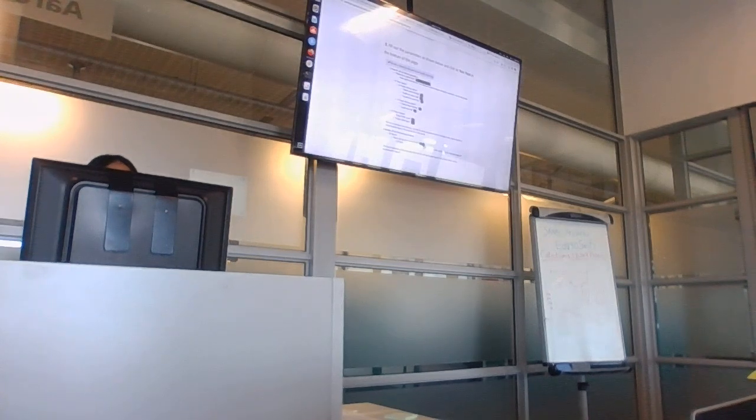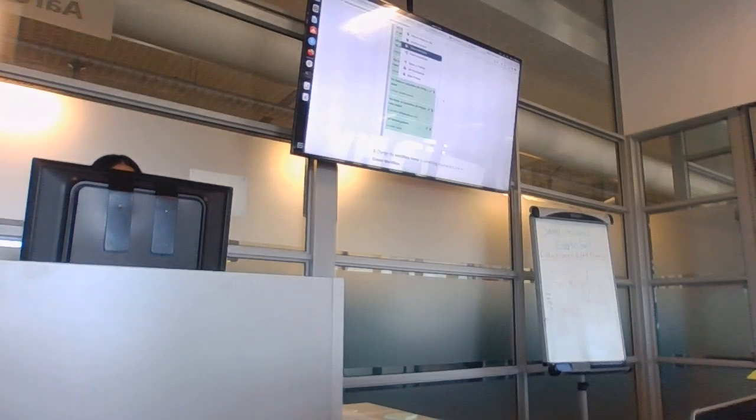Everything that we did, including the parameters that we chose, the questions we answered, how to use Kraken, it's all in there. How to create the workflow by extracting it, how to edit it, how to connect. It's all there.